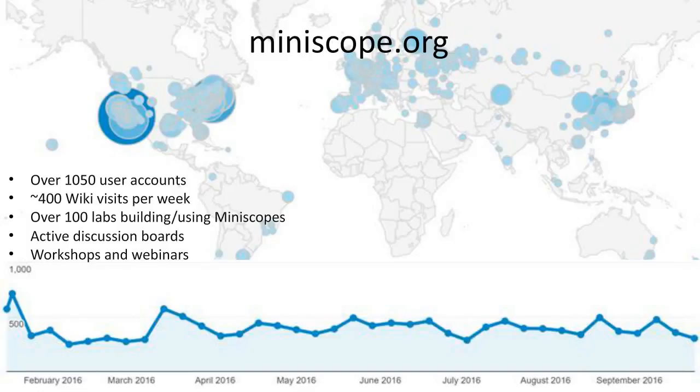So we're very happy that the obstacles to the use of these technologies have been removed, and that I've even heard of people that are instituting these microscopes in undergraduate classes or even in high schools, they're building these microscopes and using them not maybe implanted on animals, but just as desktop fluorescent microscopes as projects for their students. And so I'm really a big believer in removing all the barriers, such that all it takes is someone who has a really good idea and they could build the microscopes with very little money and be able to use it and gather data and then build off their idea.